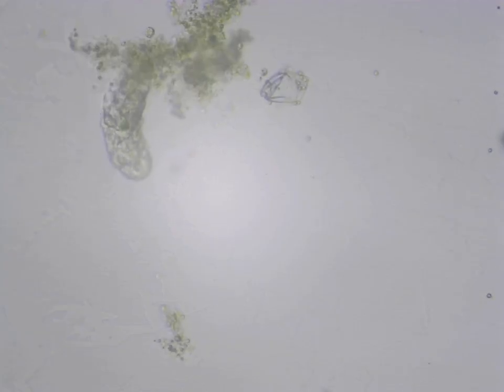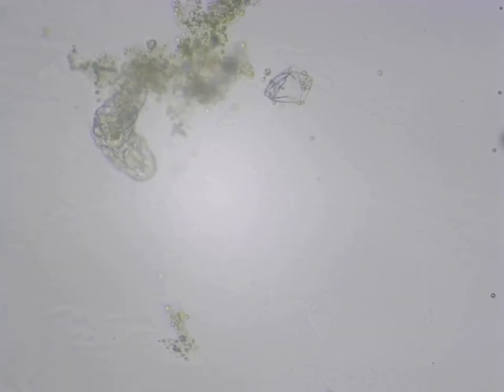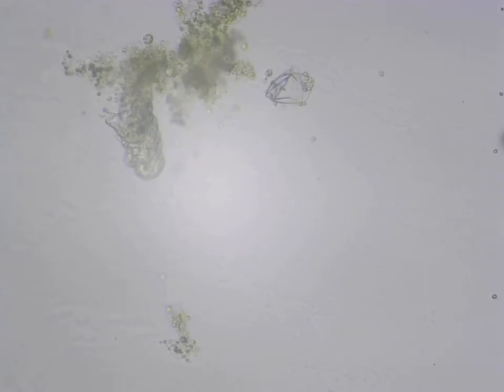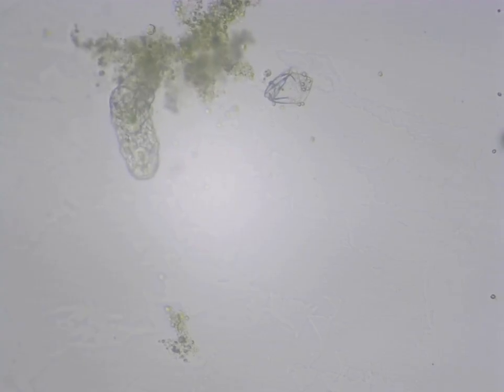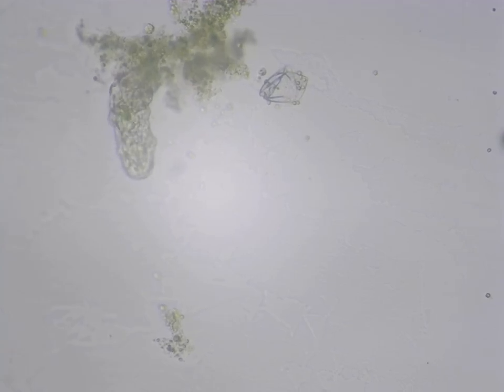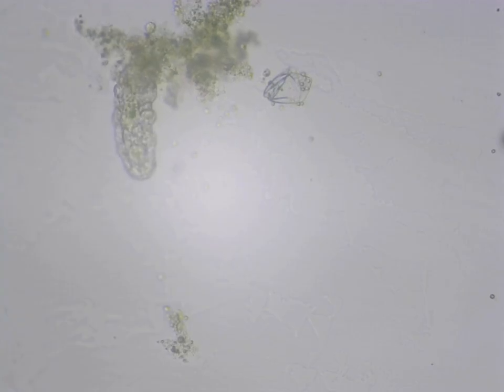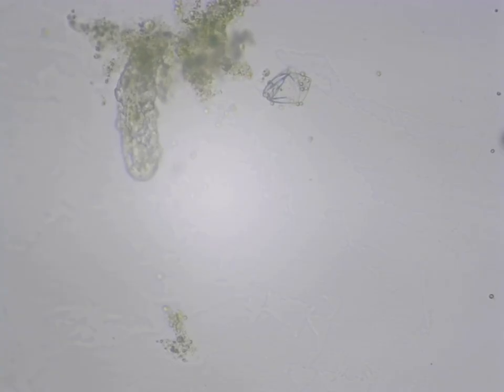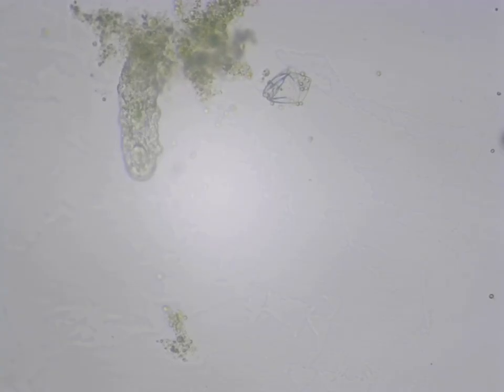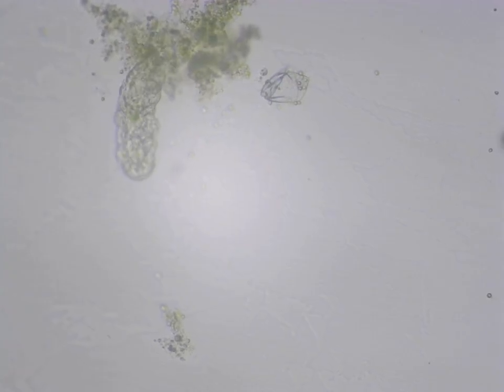Tardigrades, also known as water bears or moss piglets, are microscopic water-dwelling animals famous for their incredible resilience. These tiny creatures range from about 0.3 to 0.5 millimeters in length and are most often found in moss, lichen, leaf litter, or the sediment at the bottom of bodies of water. So what makes tardigrades so cool?